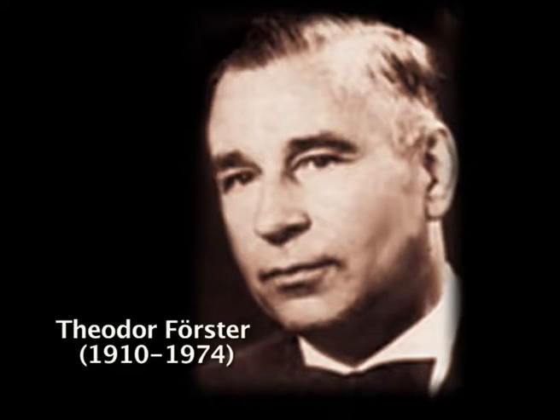phenomena in cell biology. The next assay which I am going to discuss is fluorescence resonance energy transfer or FRET, which is also known as Förster resonance energy transfer, depending on the person who actually invented it.